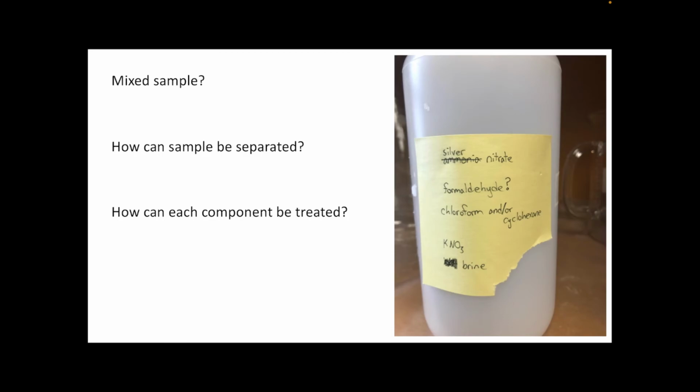And because you're first year students, you probably don't have a great idea of the chemical treatments that are possible. So one thing that you might want to use is something like the Merck Index that we've linked to in previous videos and referred to in your lab manual. The Merck Index gives you an idea of what each chemical is used for and some of the more common hazards or issues associated with them. Effectively like an encyclopedia entry for each of these different chemicals.